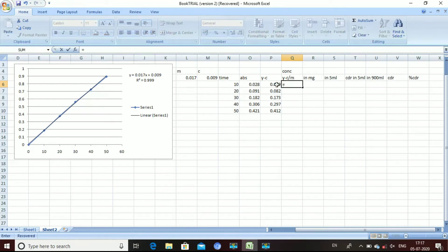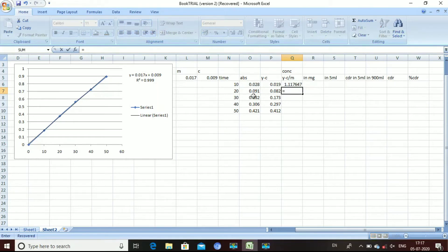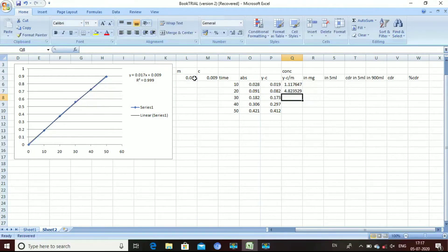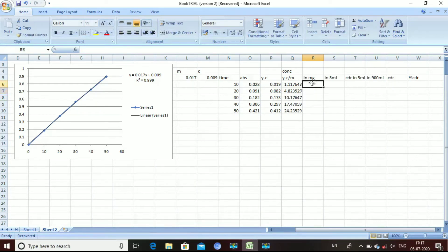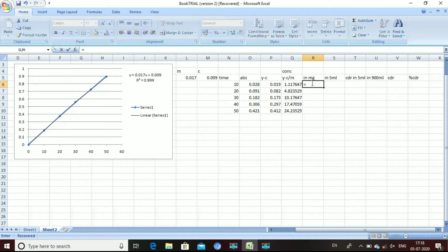For the concentration column, click on the y minus c value divided by the m value. The next column is the amount in mg. We get concentration in micrograms per mL, and since 1 mg equals 1000 micrograms, for the mg column click on the concentration value and divide by 1000.